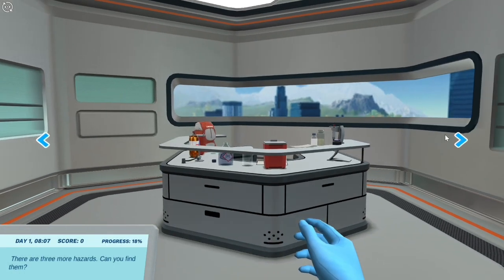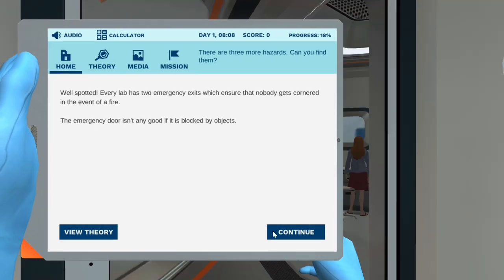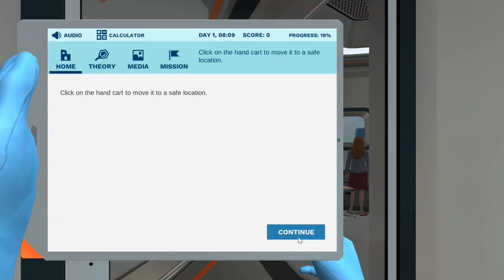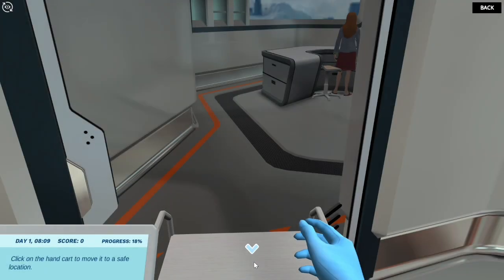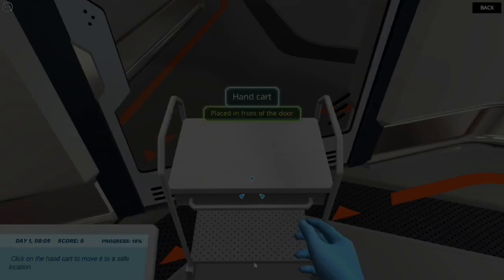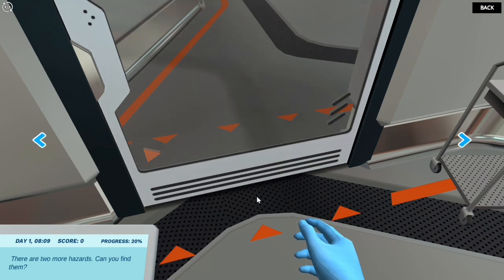Click and hold the left mouse button and move the cursor to the side to rotate the camera. Well spotted. Every lab has two emergency exits which ensure that nobody gets cornered in the event of a fire. The emergency door isn't any good if it is blocked by objects. Click on the handcart to move it to a safe location. Well done! The emergency exits have to always be cleared. There are two more hazards — can you find them?